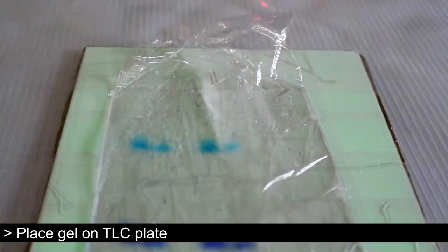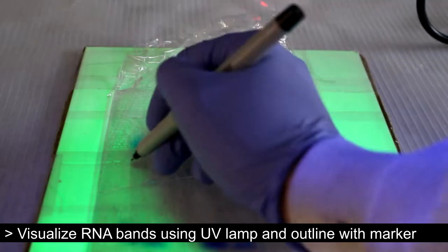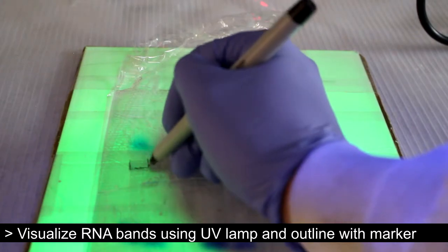The gel is then placed on a TLC plate to visualize nucleic acid bands. The bands are outlined with sharpie on the plastic wrap.